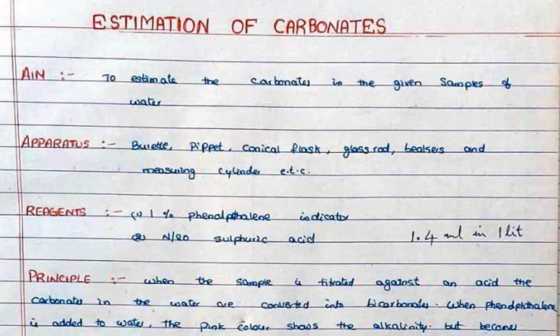Next, apparatus: burette, pipette, conical flask, glass rods, beakers, and measuring cylinders.